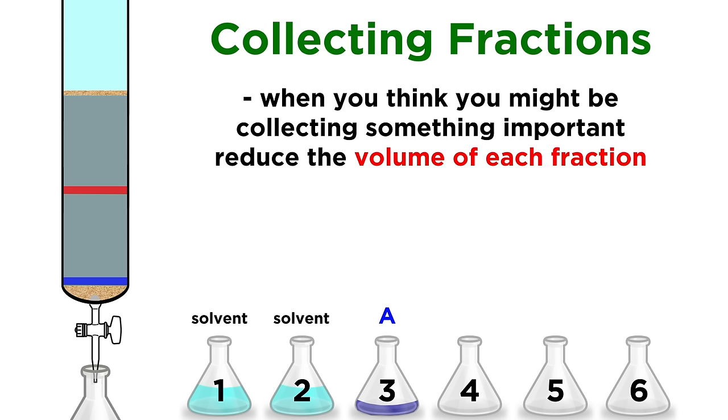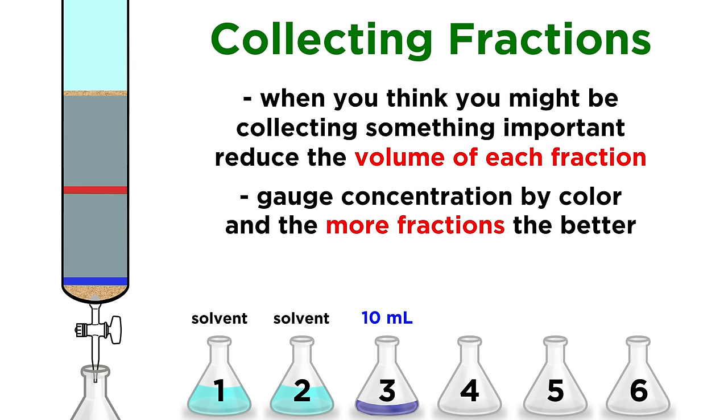When it looks like we are collecting organic material, we want to get fractions of a smaller volume, maybe ten milliliters, or even less, to maximize our chances of a clean separation. We can gauge the concentration by color. But don't be afraid to collect lots of fractions if you need to, even up to twenty or thirty is no problem provided you have enough flasks to do so.